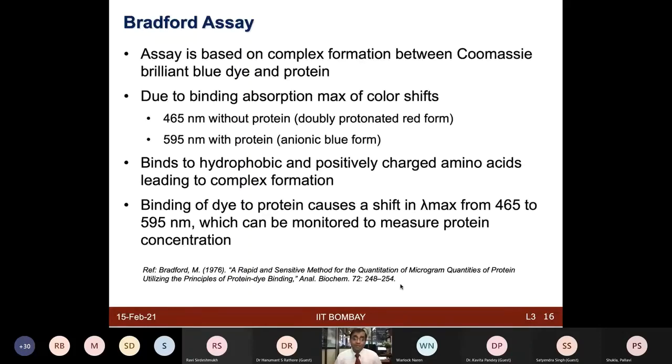They're all subjective. They give you some landmarking and some idea that okay, your protein sample is around 100 microgram, or this sample is 150 microgram. So they are giving you some relative idea, but they cannot be absolute that it is exactly 100 microgram, right? So that's where you can choose to select your own method for quantification. We are just giving you one for illustration and discussion purposes.